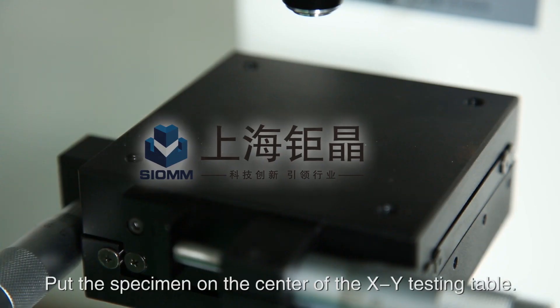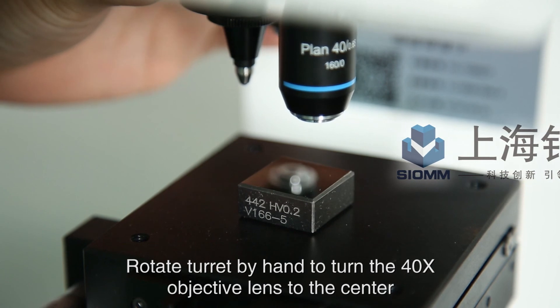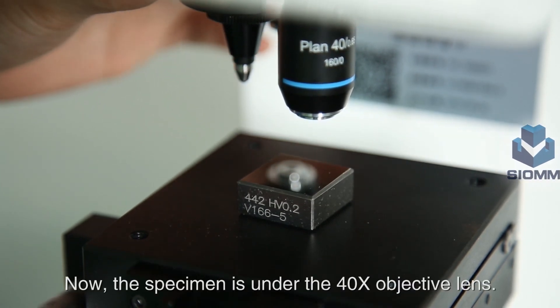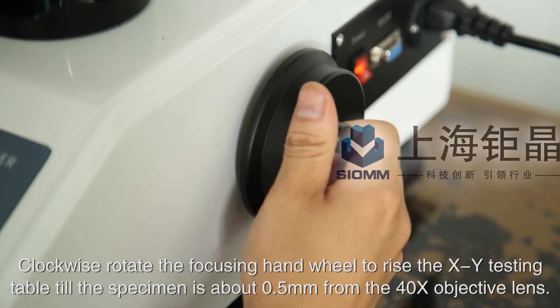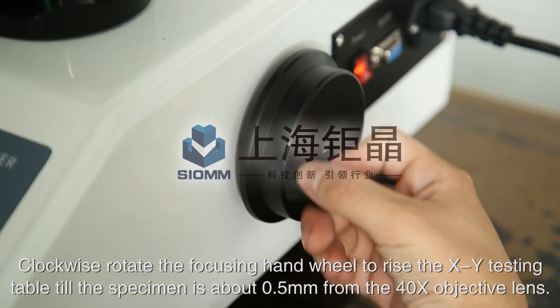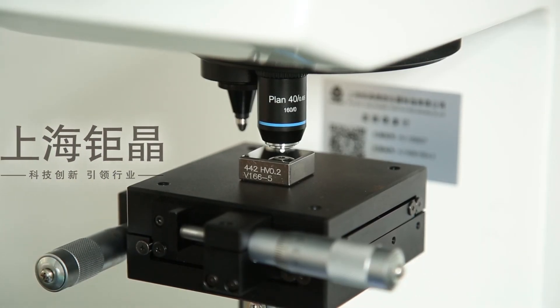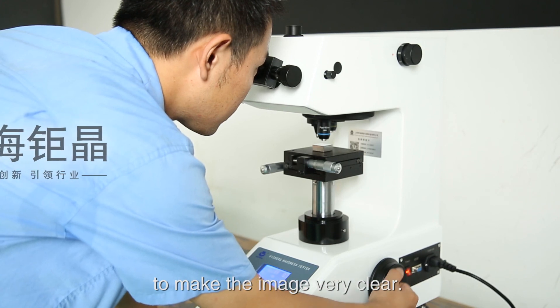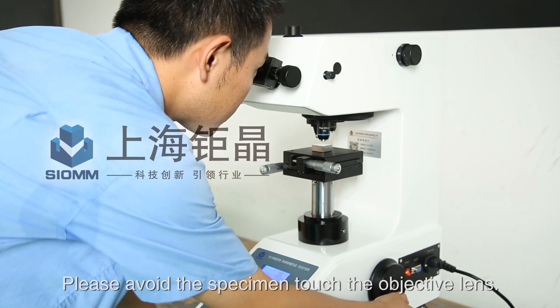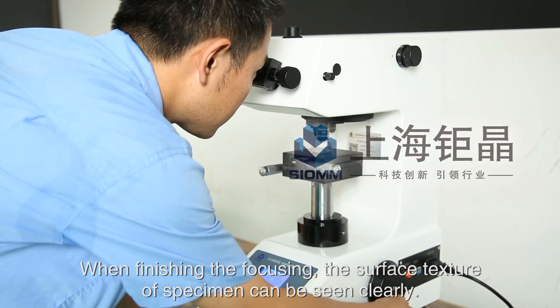Begin to test. Put the specimen on the center of the XY testing table. Rotate the turret by hand to turn the 40x objective lens to the center — the specimen is now under the 40x objective lens. Clockwise rotate the focusing hand wheel to raise the XY testing table until the specimen is about 0.5 mm from the 40x objective lens. Then rotate the focusing hand wheel gently to make the image very clear. Please avoid letting the specimen touch the objective lens. When focusing is complete, the surface texture of the specimen can be seen clearly.